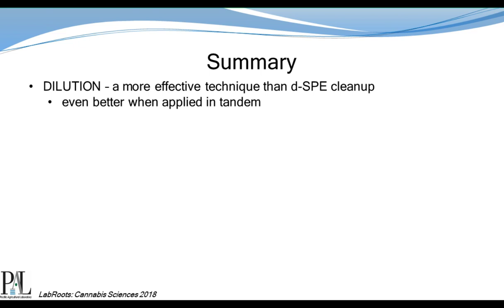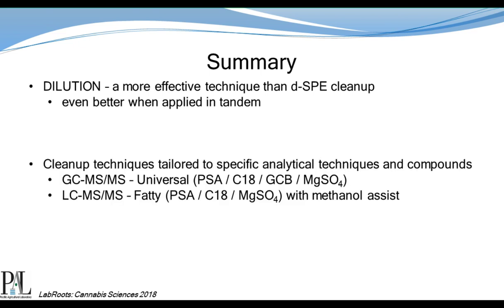One of the comments I get a lot when we're talking about this method is people say, well, it's not that big a deal, you're just doing a dilution. Well, a dilution is a more effective cleanup technique than doing a lot of other cleanups, especially related to cannabis. And if you can combine those two things, then you're just that much better off.